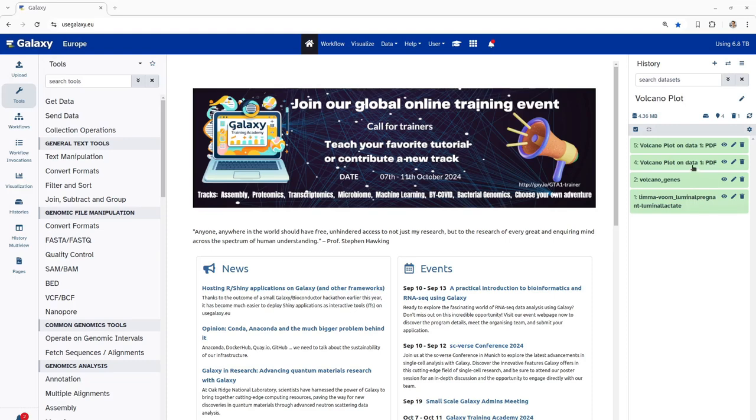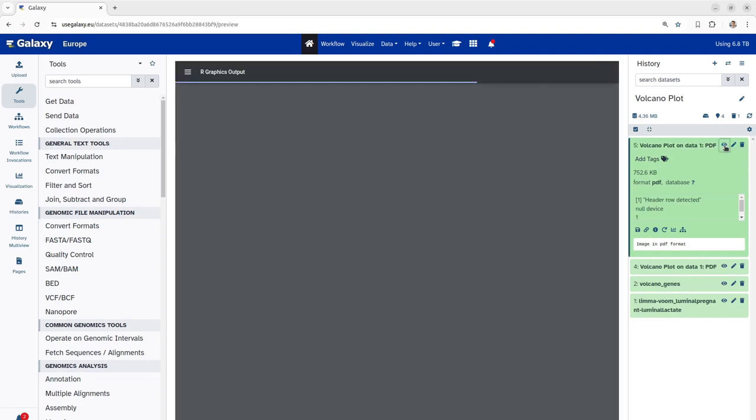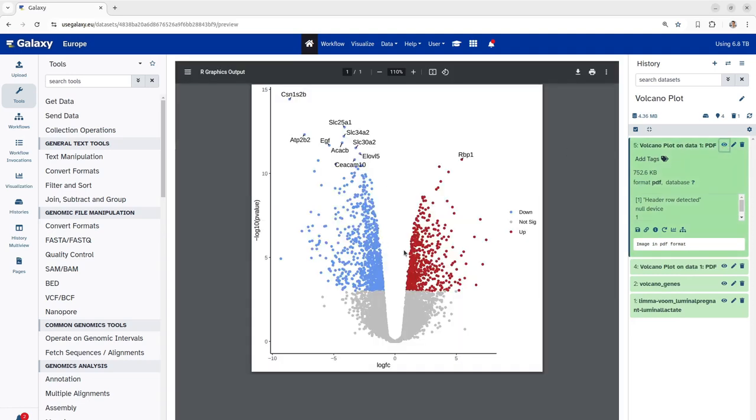As you can see, now the tool has completed and the volcano plot has been produced with the top 10 significant genes. Let's visualize this by clicking on the eye button. As you can see, here we have plotted our top 10 significant genes onto the same volcano plot. As like before, the blue dots represent the genes that are down-regulated and the red dots denote the top 10 significant genes that are up-regulated. In this way, you can plot the significant genes along with the gene labels onto the volcano plot.